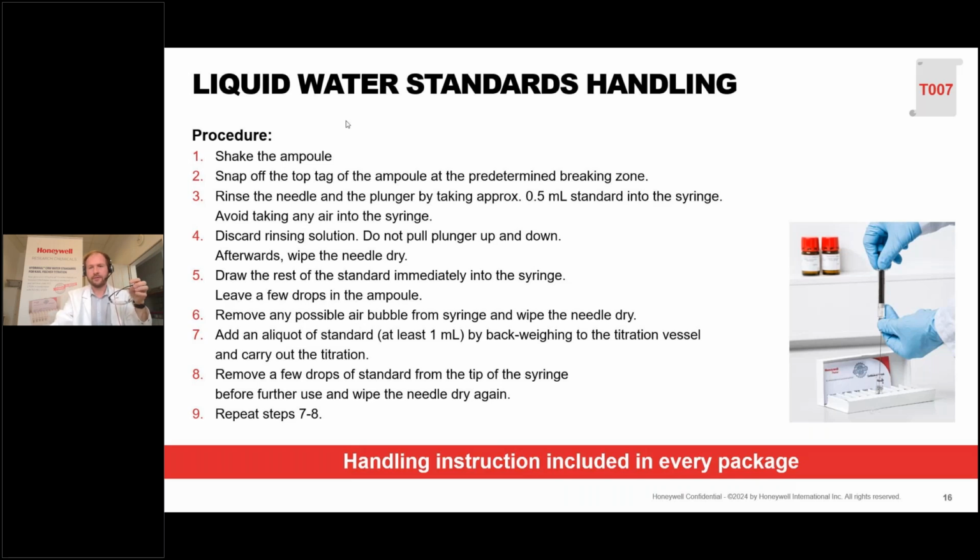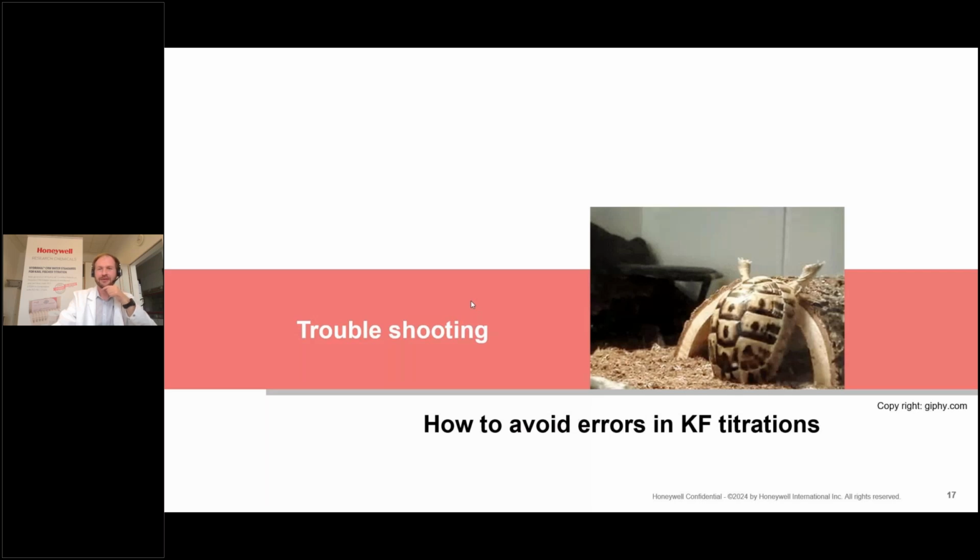I would like to discuss the next topic, which will be the troubleshooting and how to avoid errors during the KF titration. And I hope that the following slides will provide some valuable information.